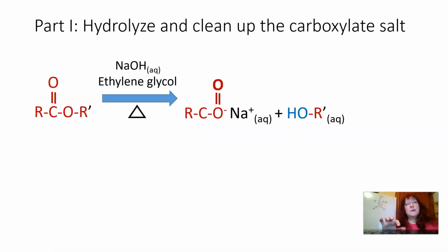All right, so once we've achieved this, what you would notice in lab is that many of these carboxylate salts are quite insoluble in the conditions that you've got it in. Might come out as a solid. We would probably have to redissolve it in some water in order to do the following step. But again, we're going to leave it in that charged state for the next step that makes use of solubility.